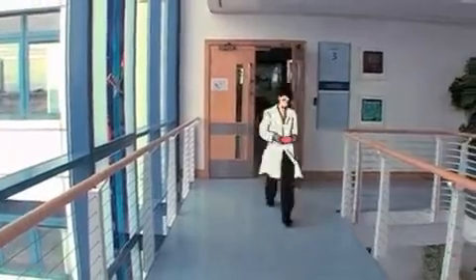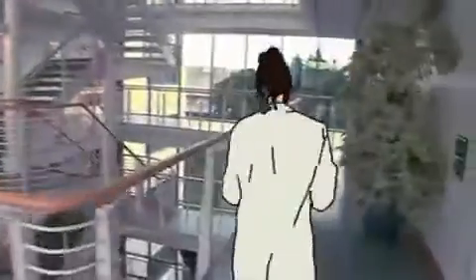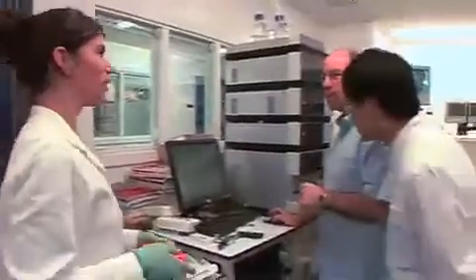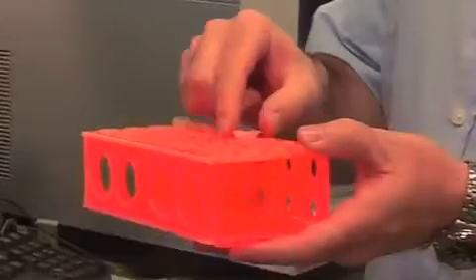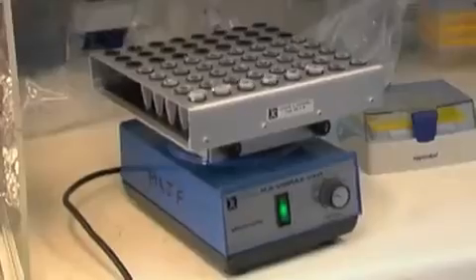Proteomics solves the problem of how you can identify all of the proteins that are involved in one of the many different activities of the cell. Our proteomics facility provides state-of-the-art mass spectrometry technology that can identify hundreds or even thousands of proteins in complex biological samples. Very large numbers of samples can be analysed using a range of high-throughput and robotic equipment.